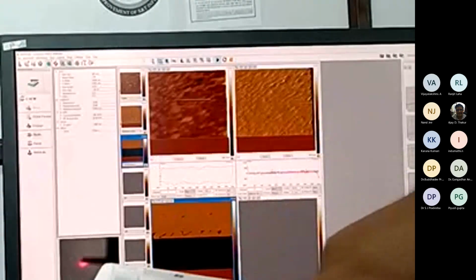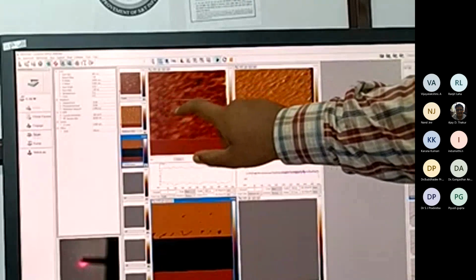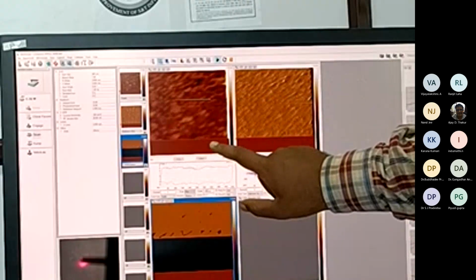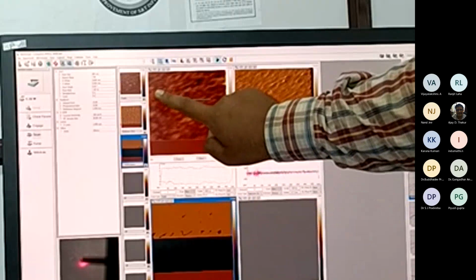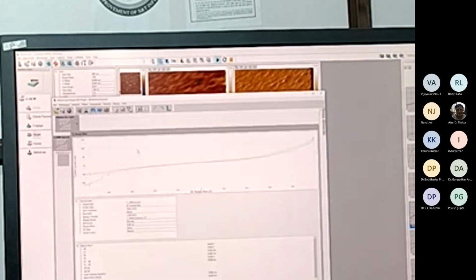We can scan, observe at which place our quantum dot is, place our cantilever there, press it, and take the IV. A similar IV has been taken here. See, this is a non-linear IV. It has been taken of a single layer of discotic liquid crystal.